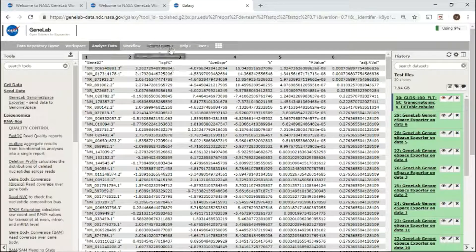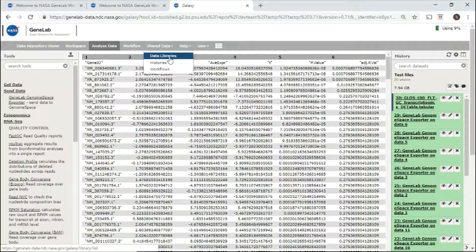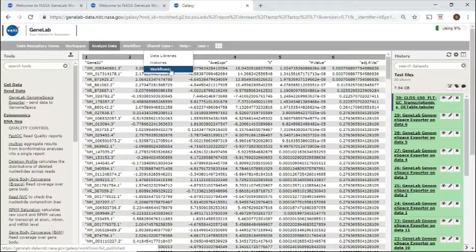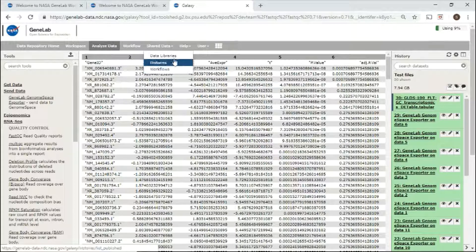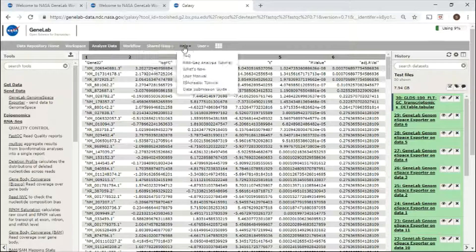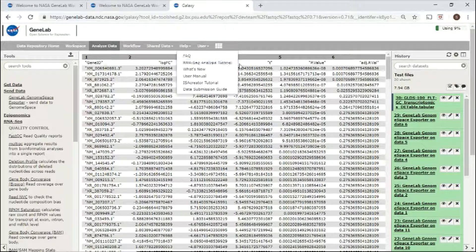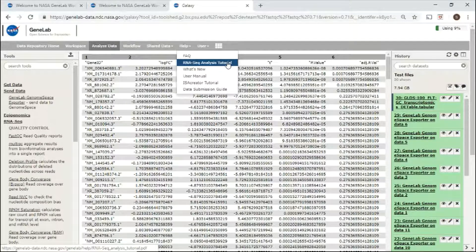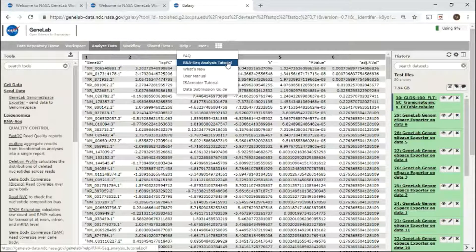You can also browse and analyze shared data and workflows provided in the shared data menu. For detailed steps on how to use the platform and perform RNA-seq analysis, follow the RNA-seq analysis tutorial located under the help menu.